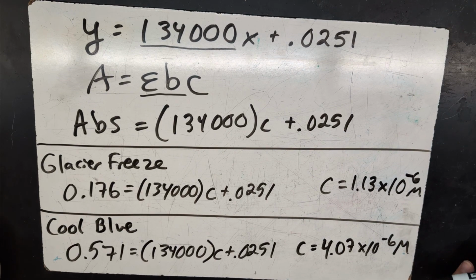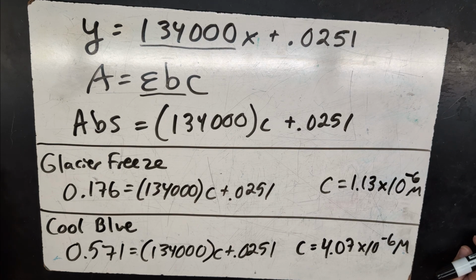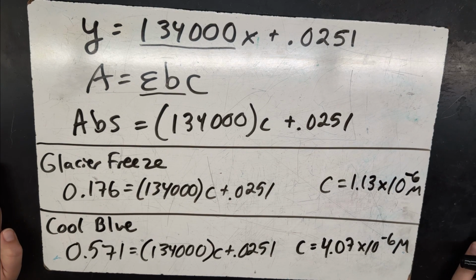I think the only other thing I want to mention with spectrophotometry labs like this is that you can absolutely use a colorimeter instead of a spectrophotometer if that's what you have. They work pretty well. You just have a limited number of wavelengths that you can choose from. You can also do this lab using a smartphone. There are some pretty good apps now that do color analysis. You just have to make sure that the students do their cuvettes as normal. Cuvettes are fairly cheap. They're worth purchasing for this because then the path length for sure is 1 centimeter and the one side is very, very clear.